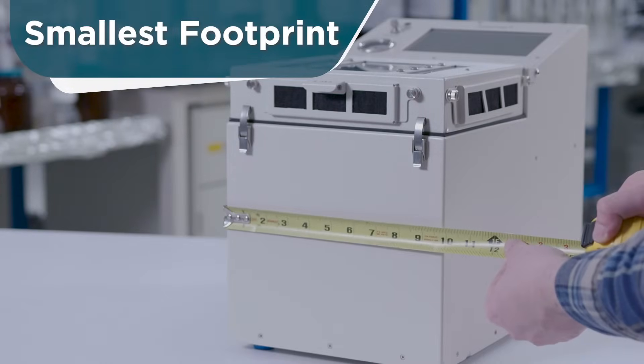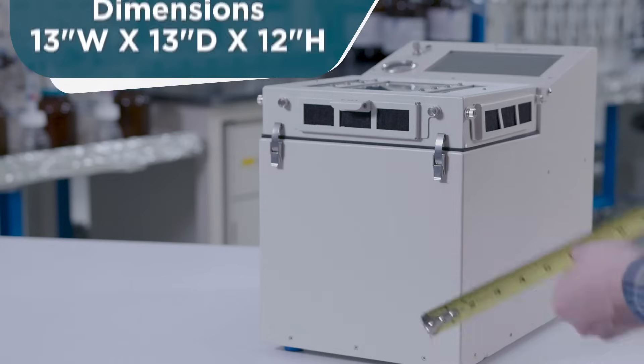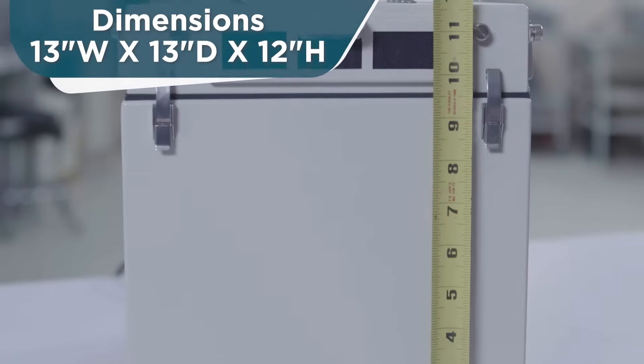The SupraVap has the smallest footprint. It takes up very little space in the laboratory and can be used on the bench or in a hood.